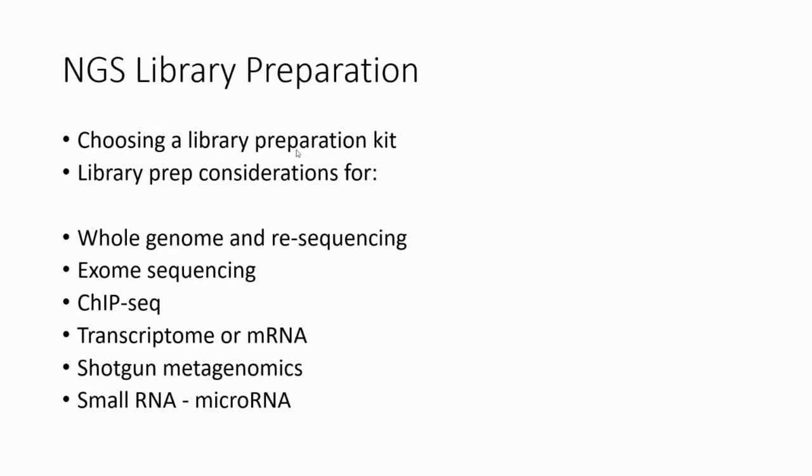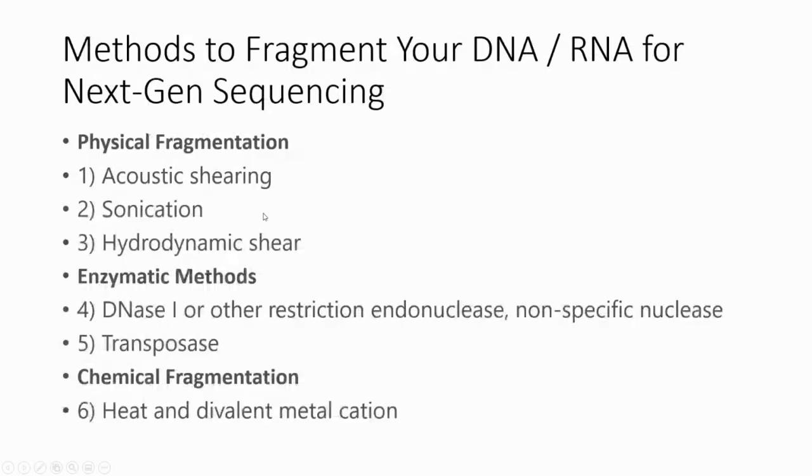Based on the application, you pick a particular target, and then you have different primers so that you can duplicate the sequence and then perform the sequencing. Based on the different application, you have a different procedure to prepare the library, which is not what we want to discuss today.